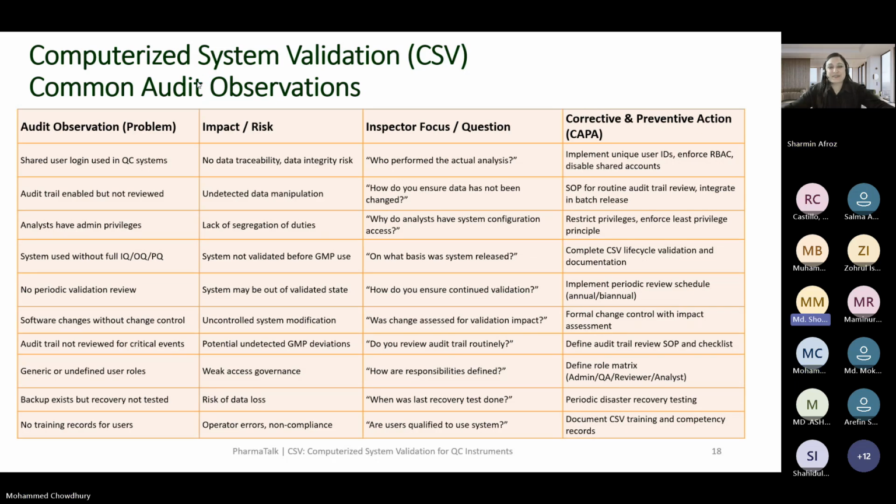Actually, yes, I'm satisfied, but in industry practice, I have seen a situation like this. I think that the admin privilege is the superpower privilege, and the admin can add, delete, or do anything. Raihan Bhai said that any self-inspection or QA oversight covers the admin activity too, and it can be checked by any QA, right? Yes. And I have seen such practice, and that's why I'm sharing. In SK, I have seen that probably some third-party auditors suggested this.